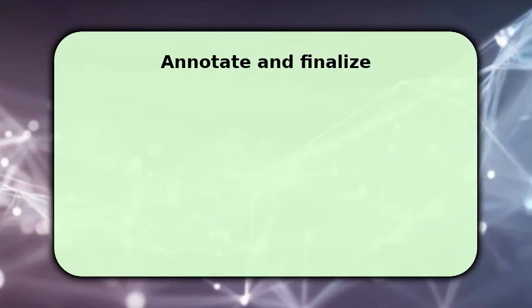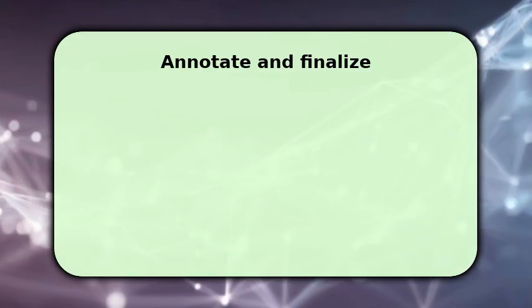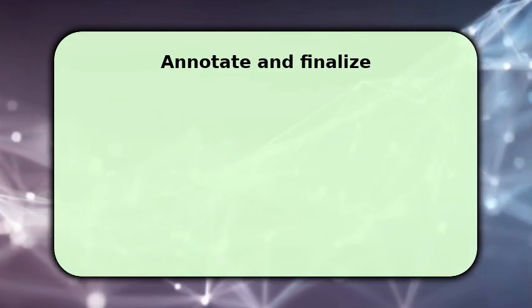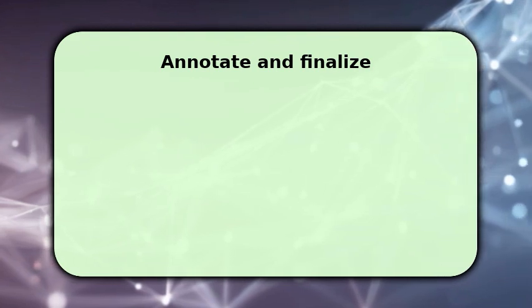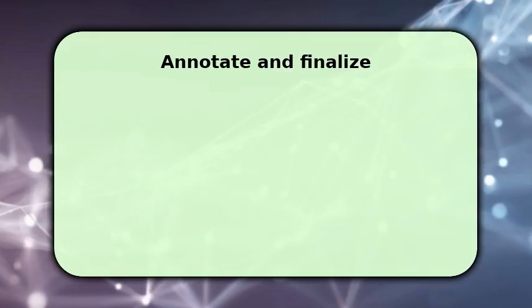If something looks off, inspect raw traces and revisit baseline correction. Often a baseline drift or incorrect smoothing causes misleading peaks. Fix that, then re-export.